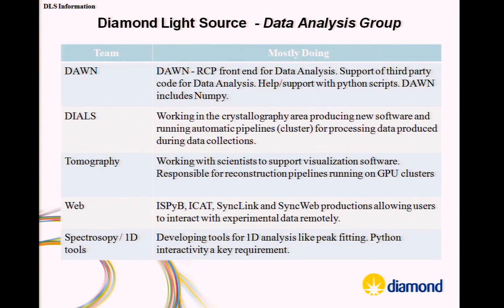We also have the tomography space where we run something called reconstruction on GPU clusters. So we have basically numerics that when you want to visualize your 3D data set, the raw data is not visualizable, it doesn't look like anything, and you have to reconstruct that into the correct data, which is basically a very big parallel number crunching problem. So that's why we use GPU clusters. For that, and we've got some web things, so people obviously need to look at their data off-site, so we have various products for looking at it on your mobile phone or in a website.